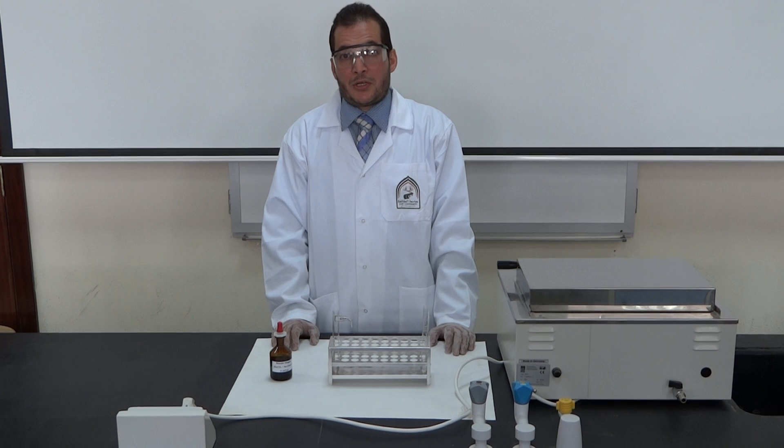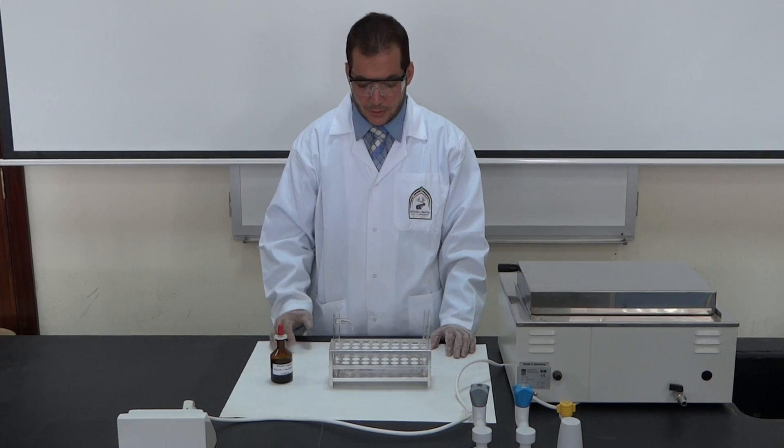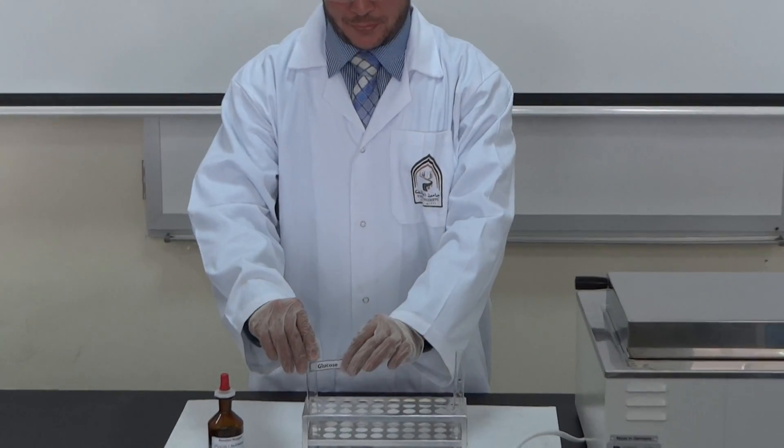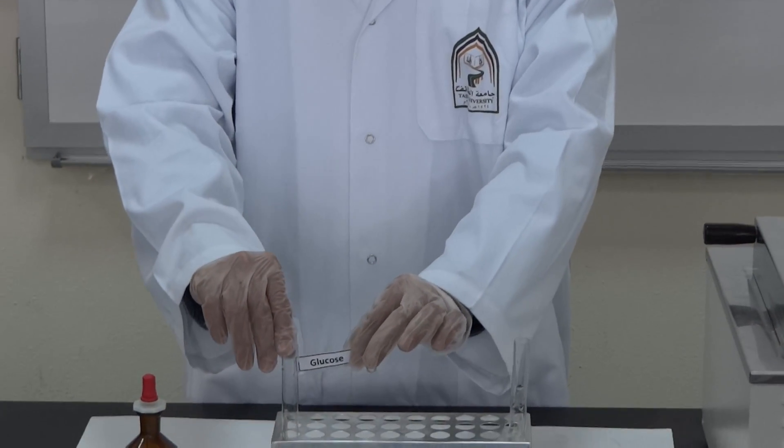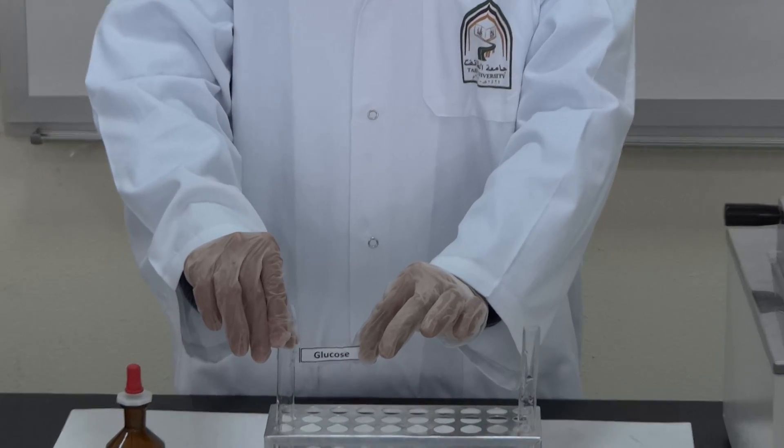For any sugar that contains free aldehyde or ketonic groups. For example, here we have glucose as an example of monosaccharides that contains aldehyde group. And here, sucrose doesn't contain an aldehyde or ketonic group.